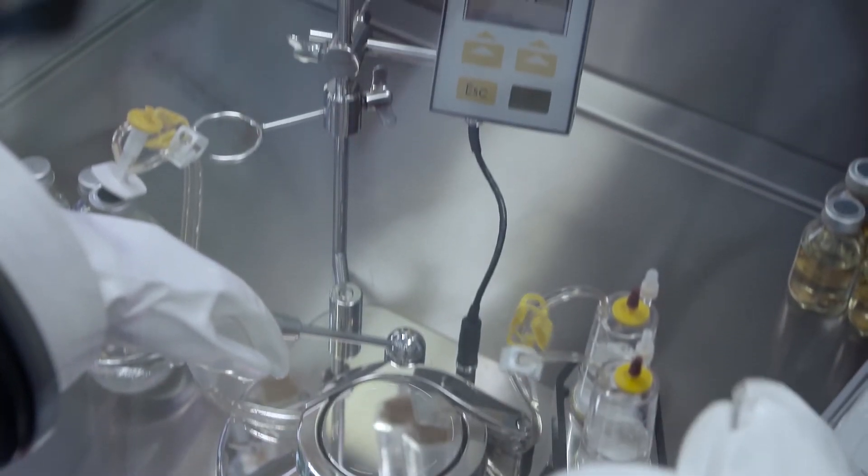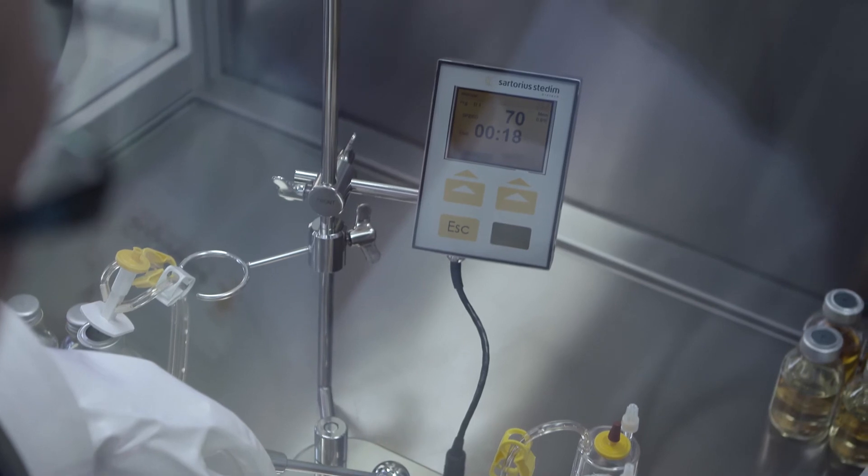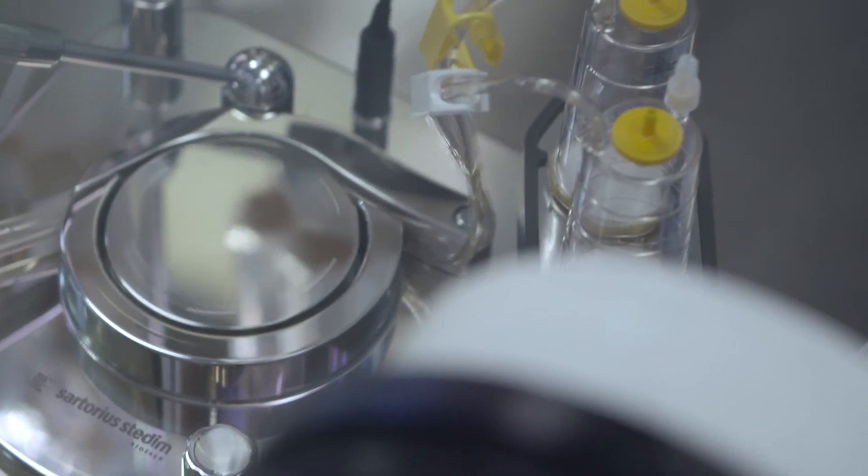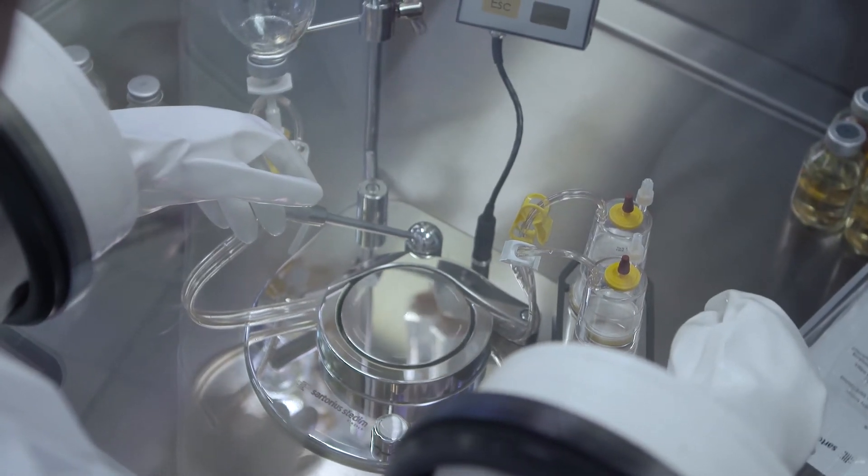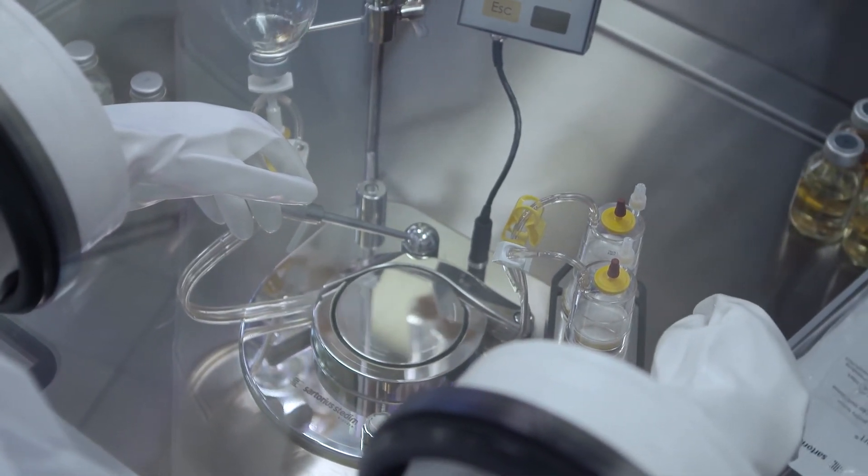During the sterility test, the Sterisad universal pump transfers the sample into the Sterisad NF filtration units. The stainless steel pump is easy to clean and can be used in isolators and clean benches.